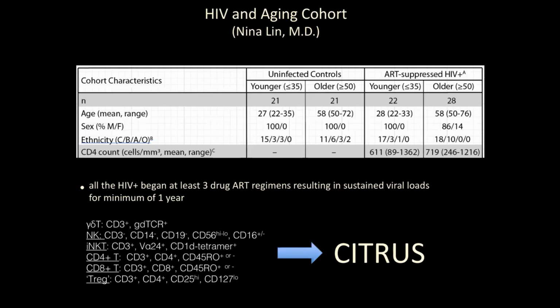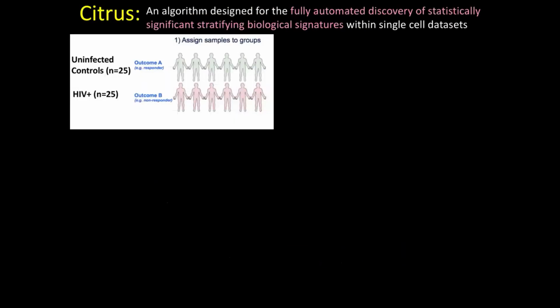We had several biologically plausible hypotheses to test, and we wanted to use some unbiased analysis to go through those hypotheses and actually mine for new hypotheses. And here we go to Citrus. So we fed all our flow cytometry data to Citrus, and Chunjung has already walked you through the general outline, so I'll just focus on the specifics of the study.